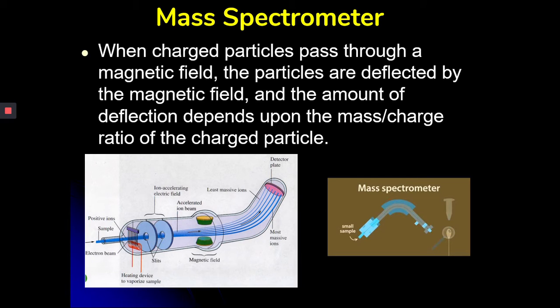We're going to watch a video that describes how the mass spectrometer works and information about how it hits the detectors. I highly suggest that you continue taking notes that they are showing you in this video.